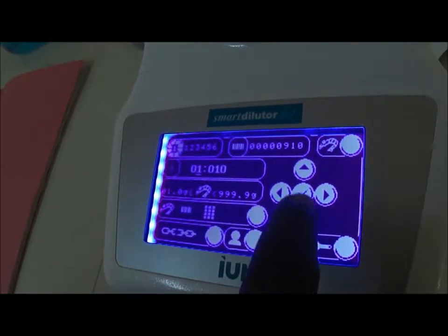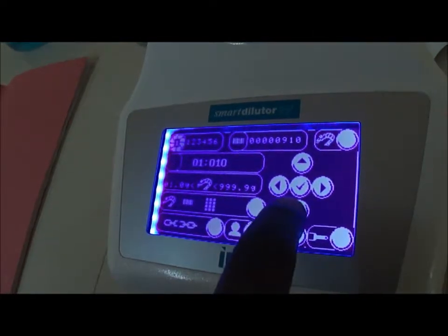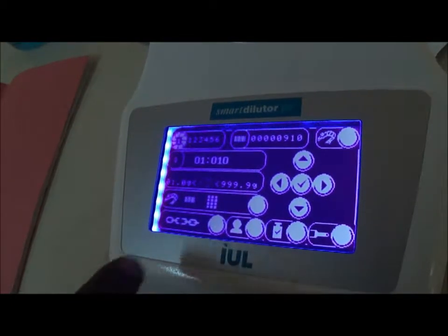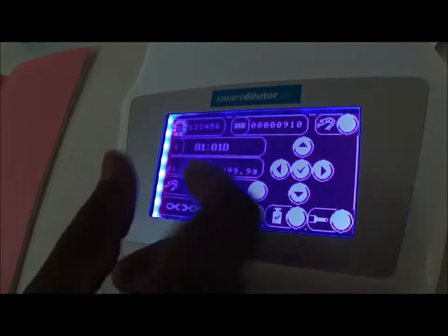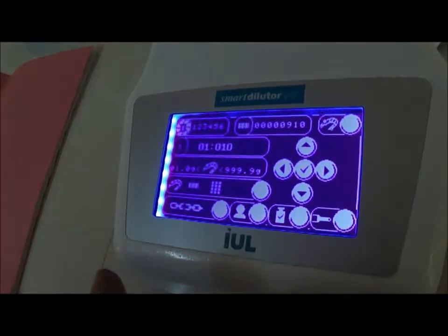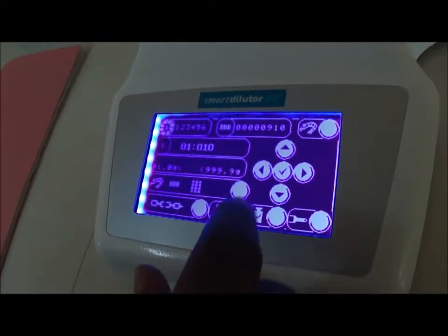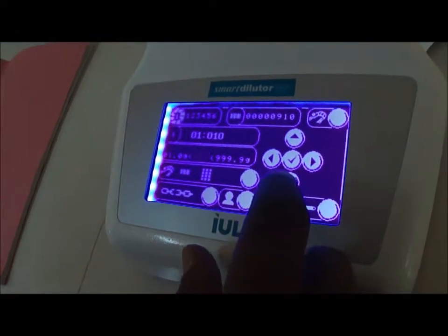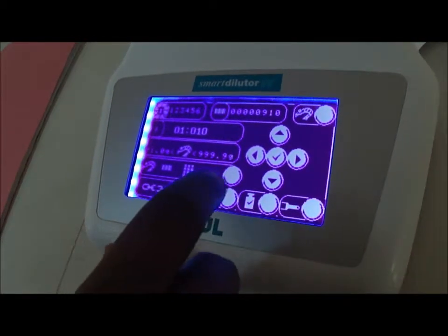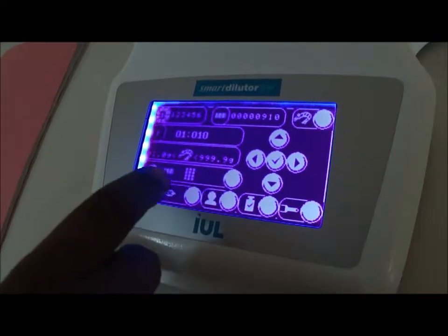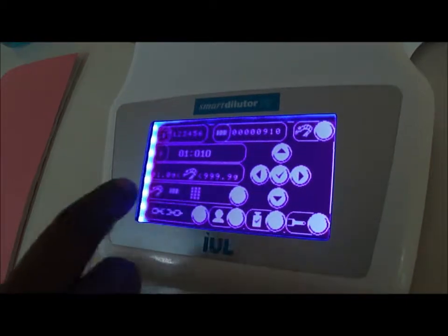That's okay. And also, if it's okay, then I press the V and I'm out. I move to the following field. And then I can choose the interval of minimum and maximum weight of my sample, to have more precision. Or I move in the next field, by pushing the button down. Or directly by pushing this around the circle, where you have the keyboard and where you can give an ID, a number or a name, to your sample.